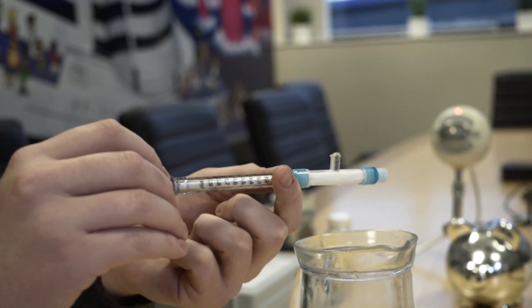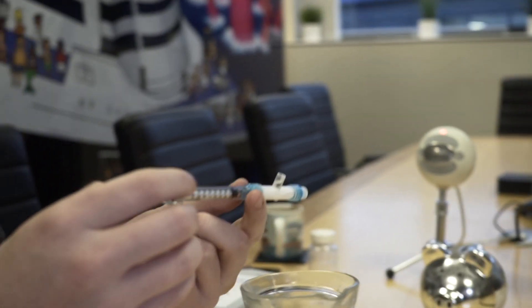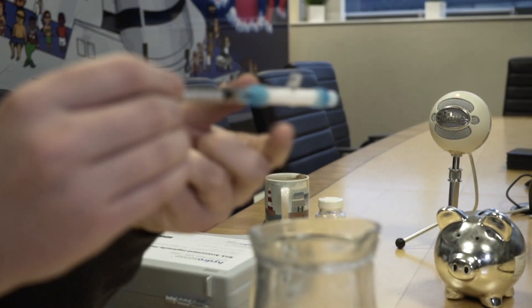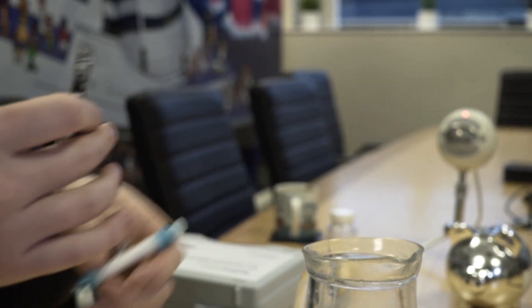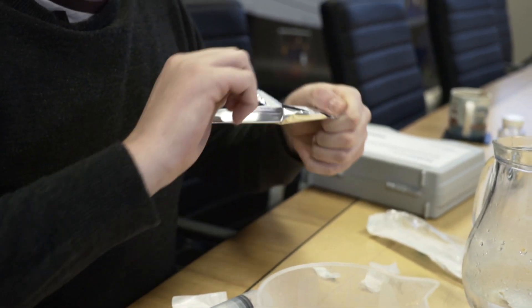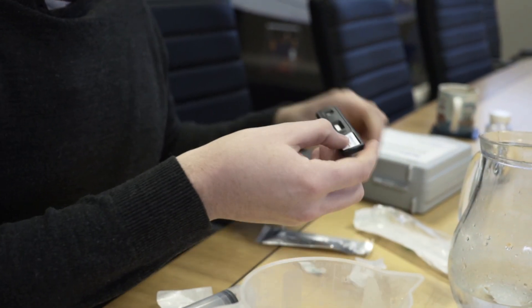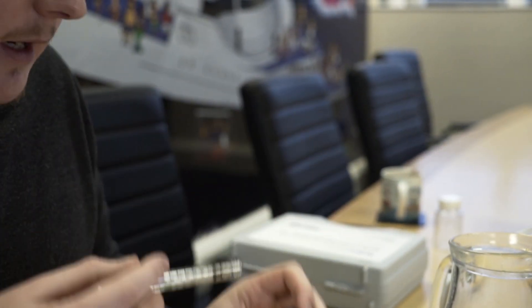So now it's time to actually take the sample. We're going to pull it back to the 0.1 ml part of the syringe and remove. We're then going to take the test strip — and a lot of you who have already used our Legionella kit will be very familiar with this. What we're going to do is take our 0.1 ml sample and place it on the strip.